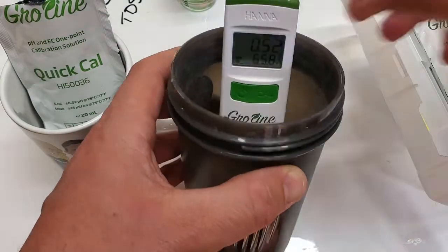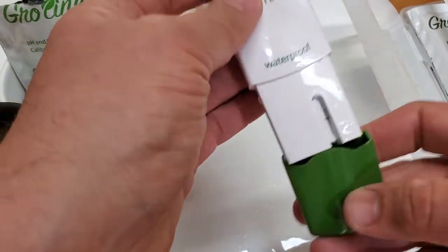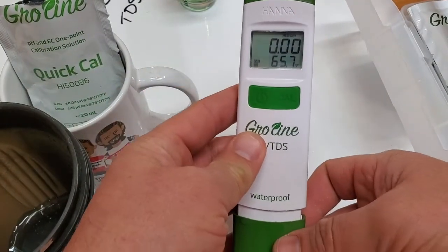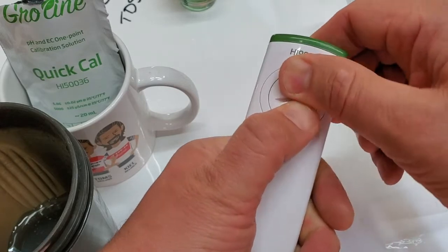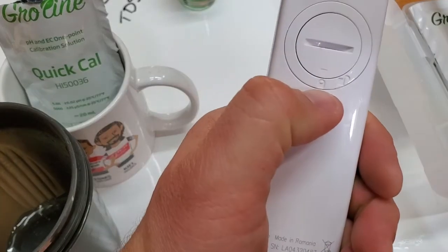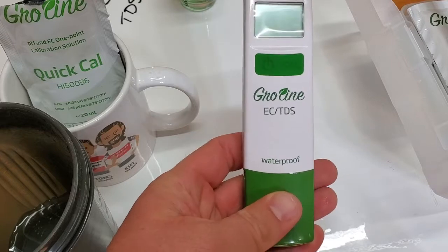EC — a nice reliable handheld meter. Put the cap back on, a little pressure on it, turn it to the little lock, and it's waterproof and bulletproof. These things are hardy little meters.